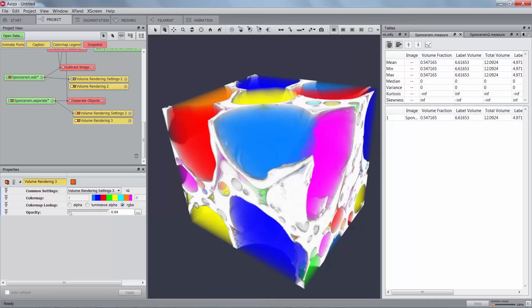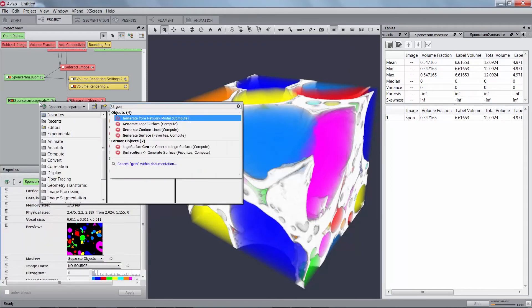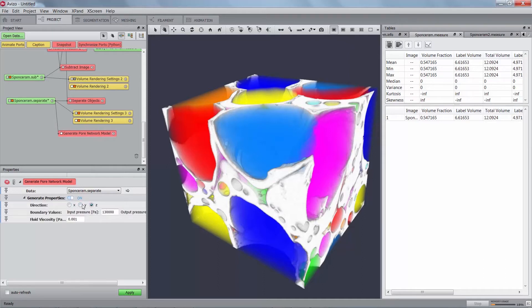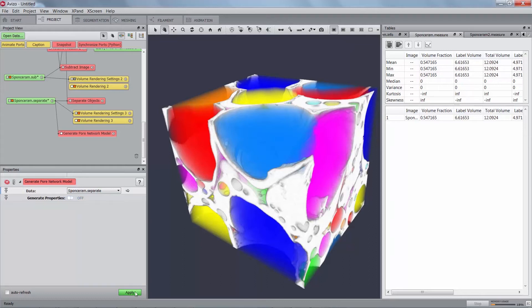In the next section we will generate and analyze the pore network. Generate a pore network model using the GeneratePoreNetworkModel module. Set the input to the separated and labeled pore space. You can also turn on the GenerateProperty switch to generate the absolute permeability, tortuosity, total flow rate per second and flow rate per second for each throat. Those properties are available since the 9.4 release of Aviso and the 6.4 release of Amira. We will turn off the GenerateProperty switch for this tutorial. Hit the apply button.